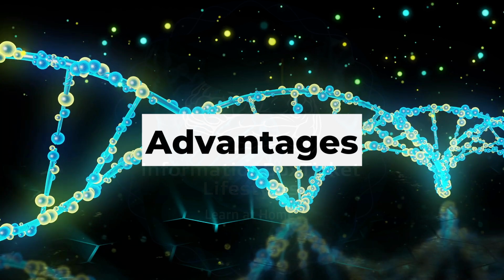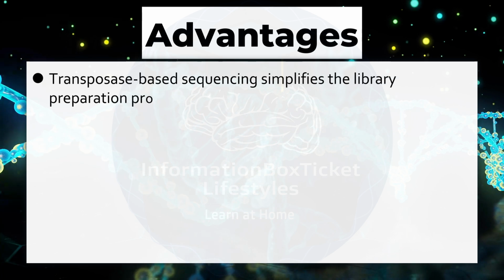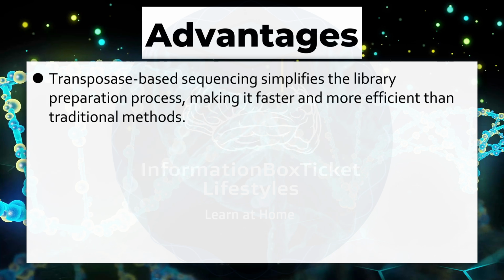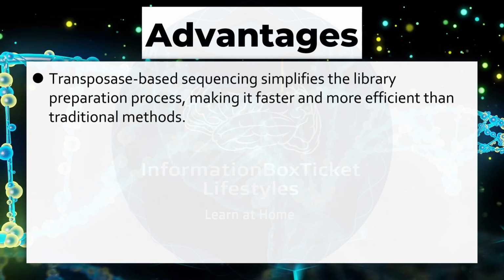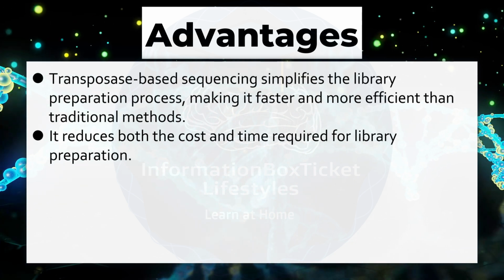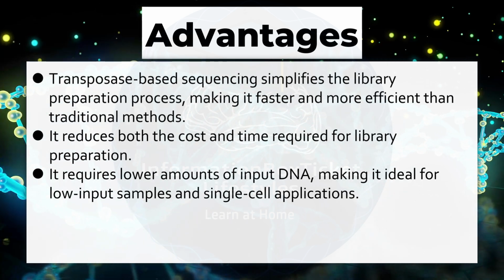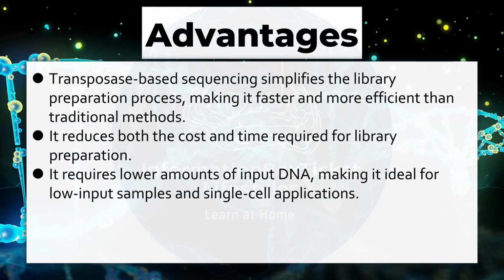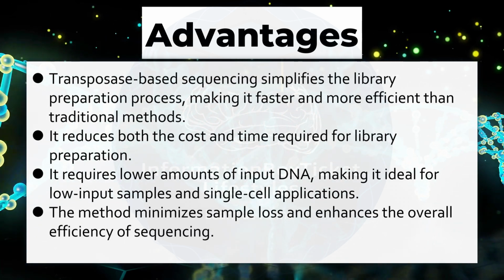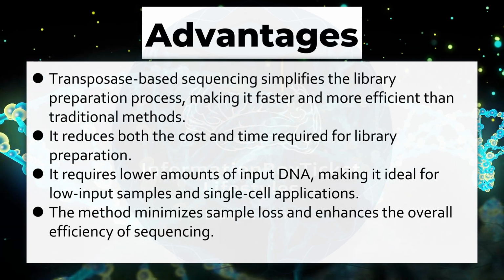Advantages of transposase-based sequencing. Transposase-based sequencing simplifies the library preparation process, making it faster and more efficient than traditional methods. It reduces both the cost and time required for library preparation. It requires lower amounts of input DNA, making it ideal for low-input samples and single-cell applications. The method minimizes sample loss and enhances the overall efficiency of sequencing.